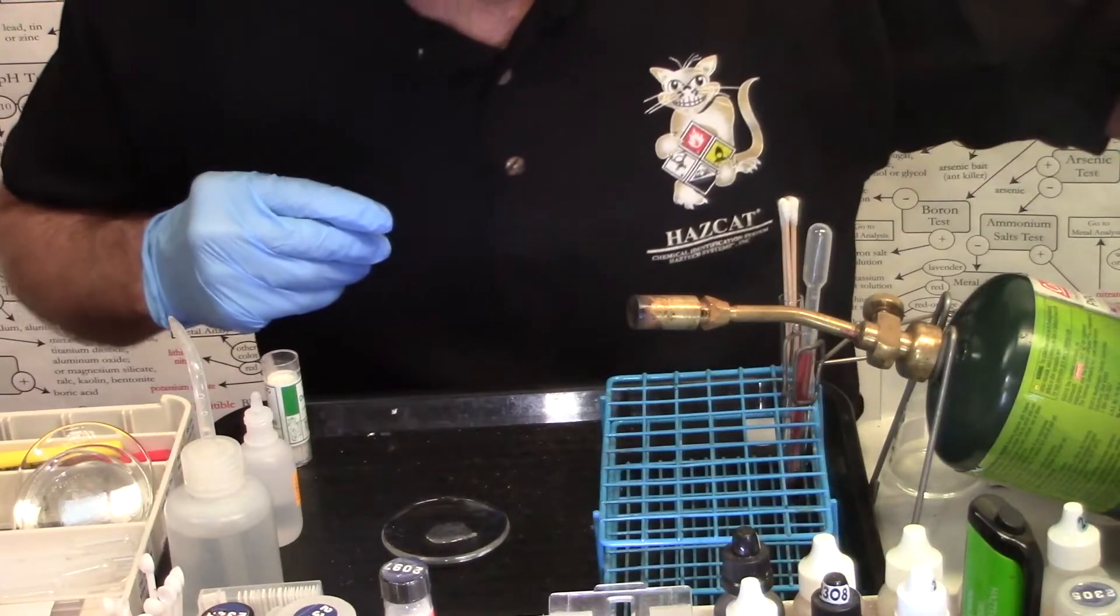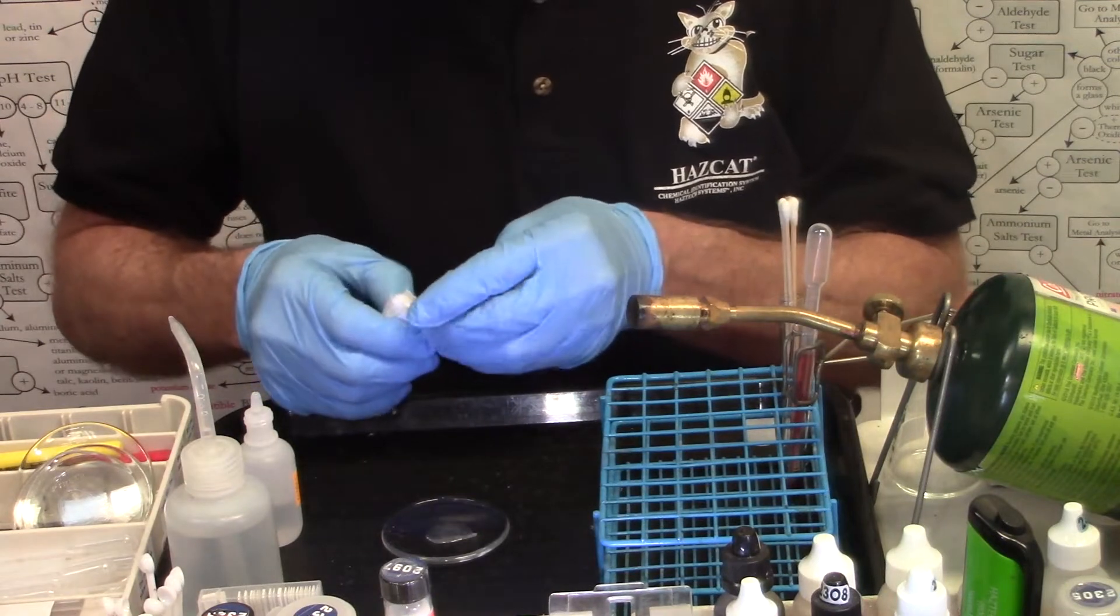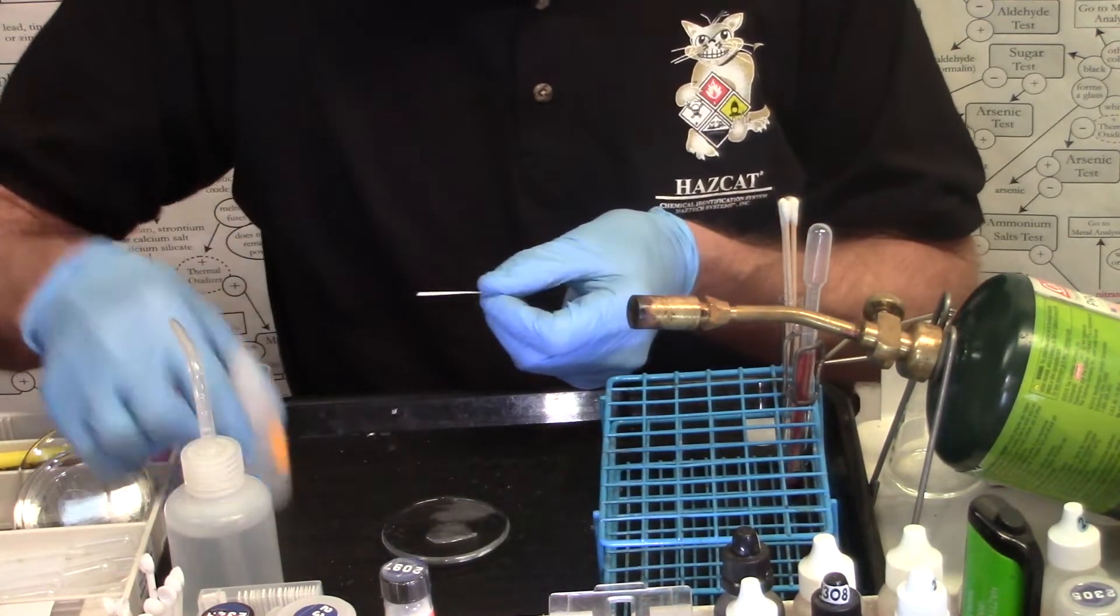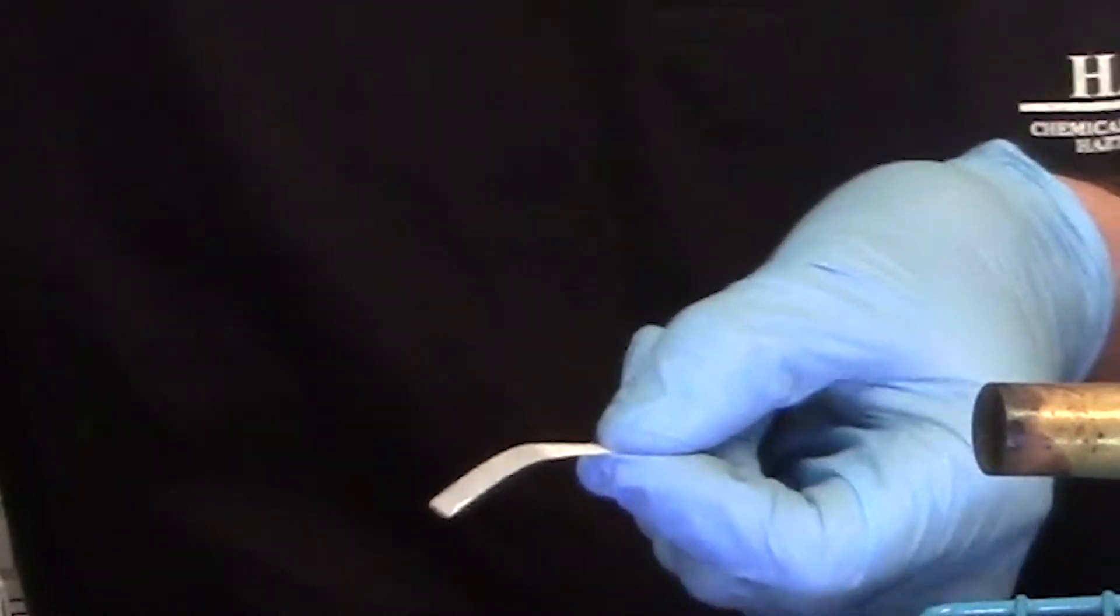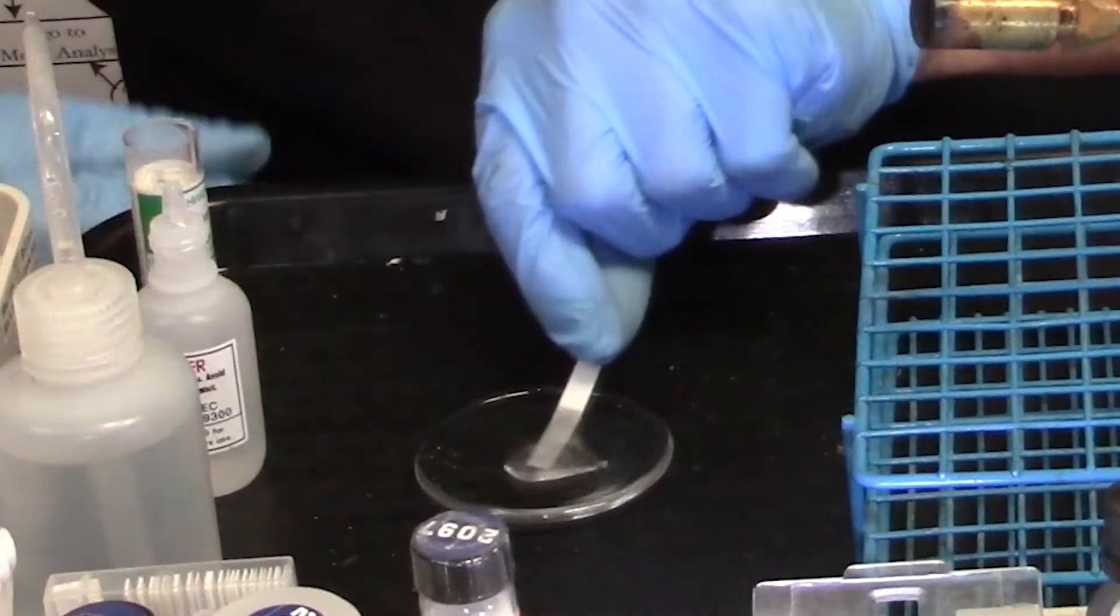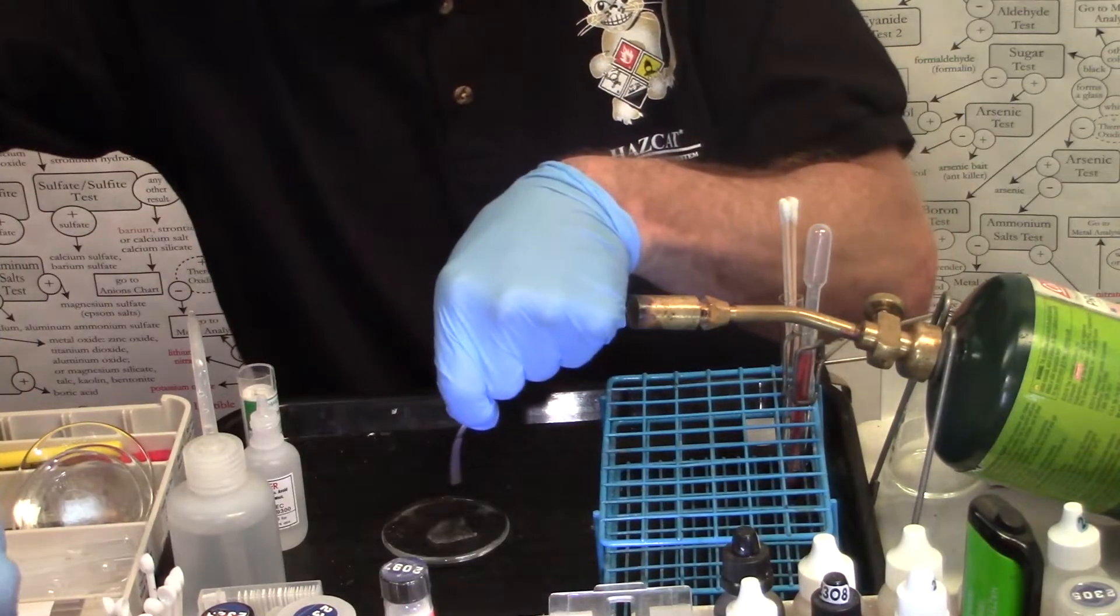To a watch glass. Once again, a strip of oxidizer test paper. Wet it with two drops of hydrochloric acid, RE2301. And that's one one thousand, two one thousand, three one thousand, four one thousand, five one thousand.